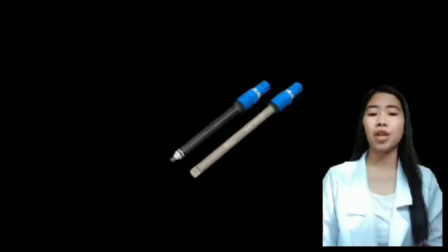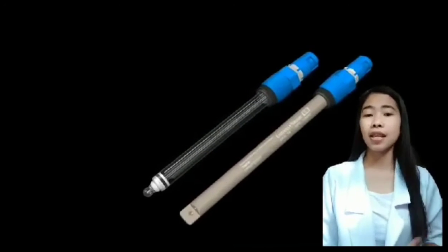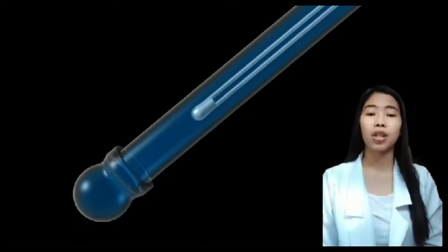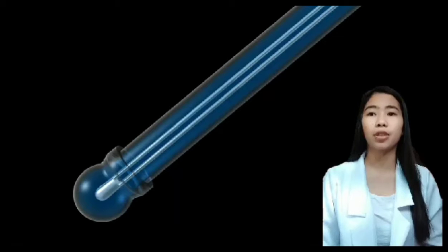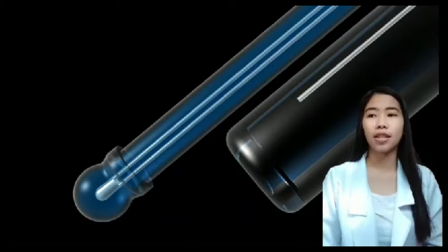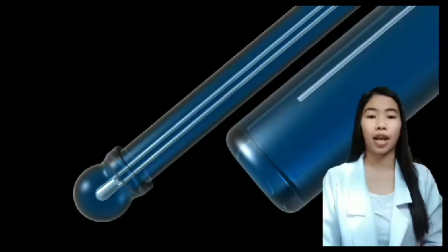So, potentiometric pH measurement is the measurement of potential differences using the so-called glass electrodes or non-glass electrodes. In the case of a glass electrode, the pH-sensitive element is a glass bulb that is fused to the end of a glass tube. The electrode is filled with a neutral potassium chloride solution, buffered to pH 7, and contains a silver chloride wire that forms the electrical connection.